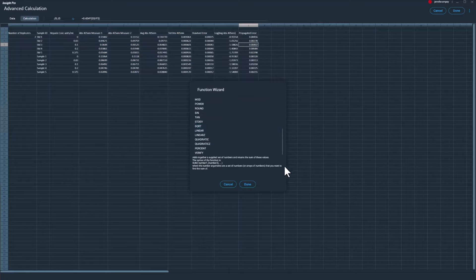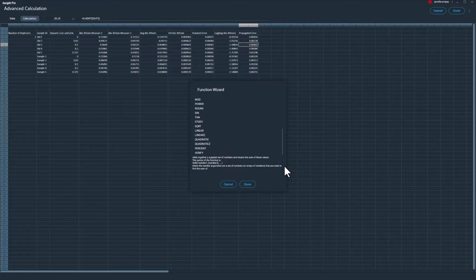In addition, basic fitting procedures using either linear or quadratic functions can be used to fit the measured data and obtain appropriate fitting parameters.